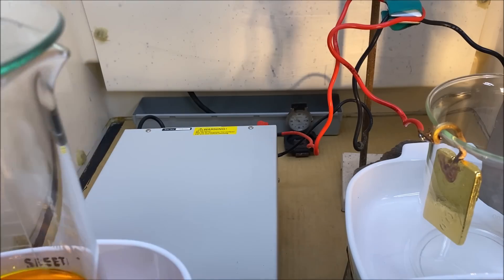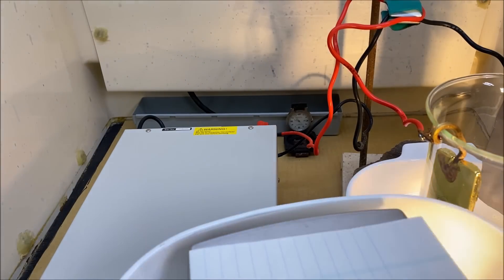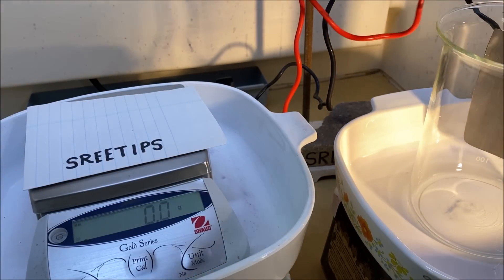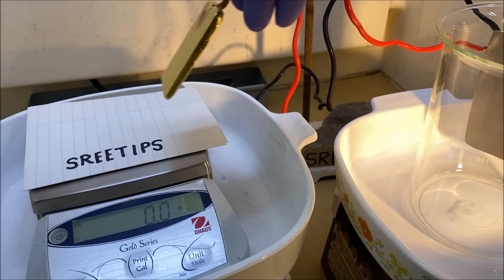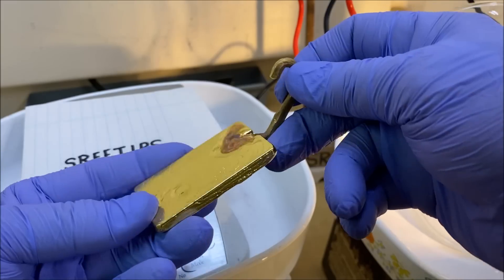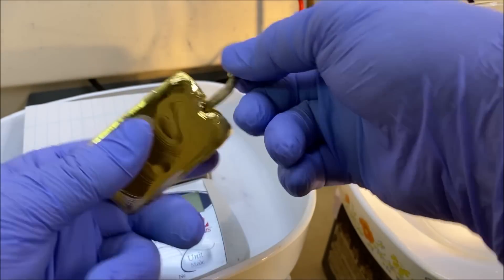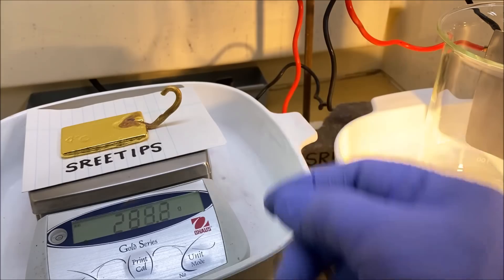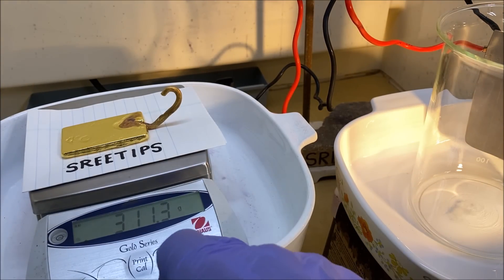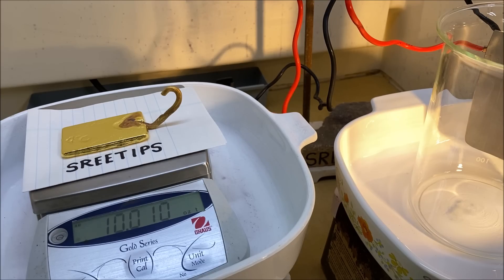Before we get started with the experiment, I want to get a weight on the anode bar. I'm just going to unclip this and throw it on our scale. Let's see what kind of weight we got on this thing. It's 311.3 grams, which is right at 10 troy ounces.